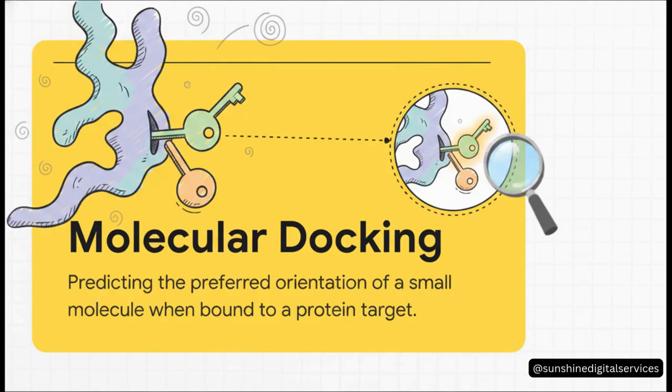But it goes way beyond just a static fit. It's about visually understanding specific binding affinities and evaluating energetic favorability. PyMOL lets structural biologists really dig in and analyze things like steric clashes and hydrogen bonding networks, ensuring that the key actually works and the fit is energetically sound.